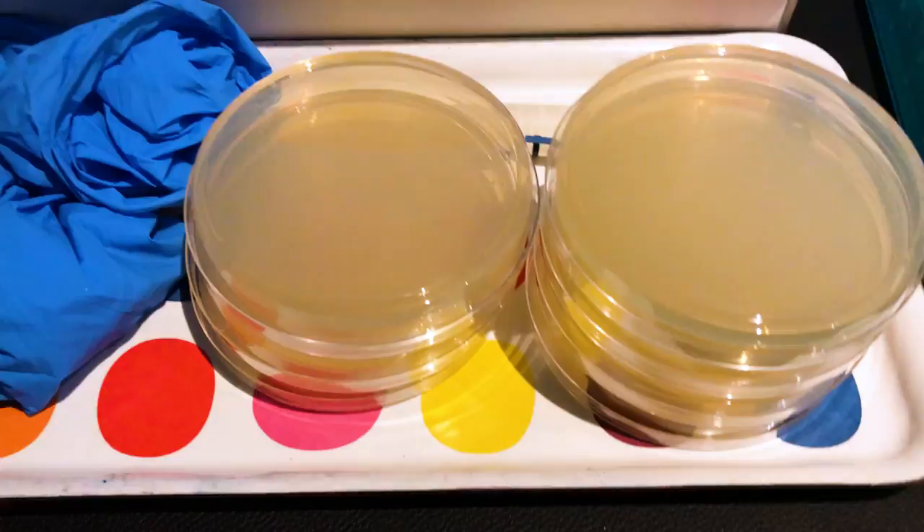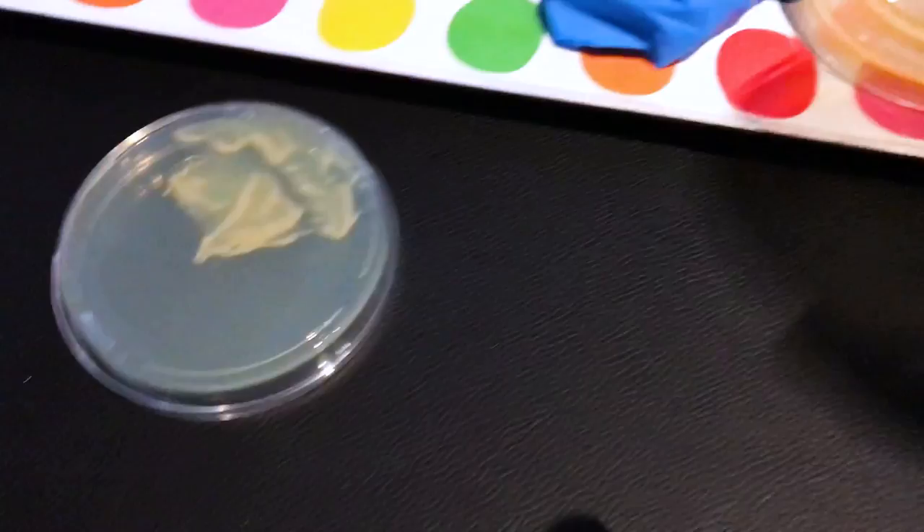Now we leave it overnight. The next morning I practiced my pipette technique and then examined the agar plates that we left to set the night before.